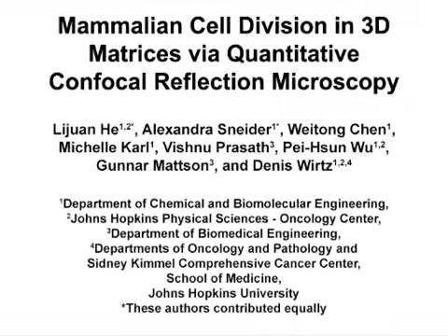The overall goal of this procedure is to study mammalian cell division and cell matrix interactions in a physiologically relevant 3D environment. The main advantage of this technique is that it provides an efficient and general approach to study mammalian cell division and cell matrix interactions. This method can help answer key questions in cell biology, such as the molecular basis of the development of normal and diseased tissue.